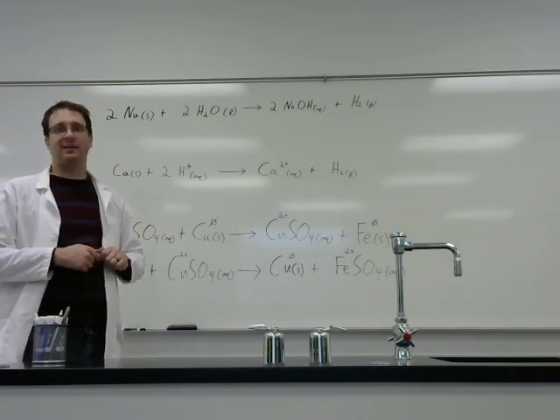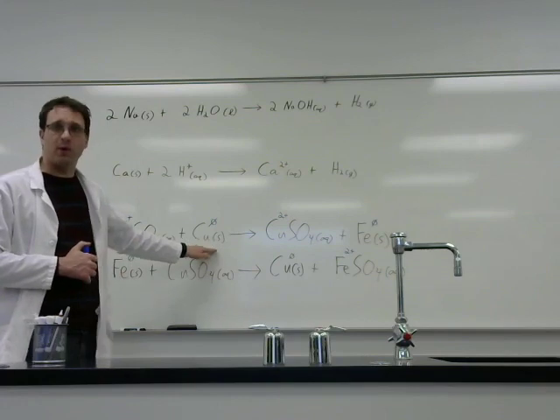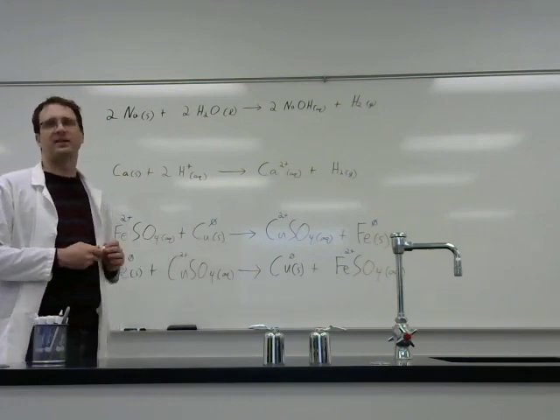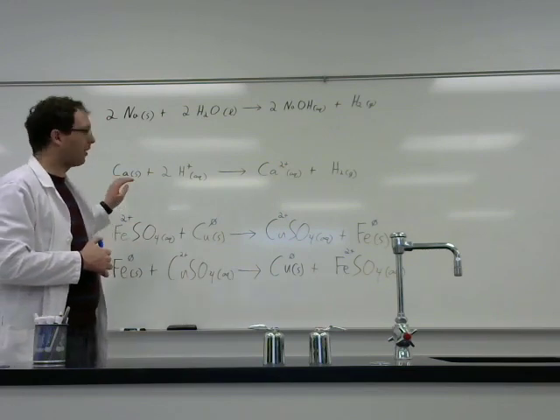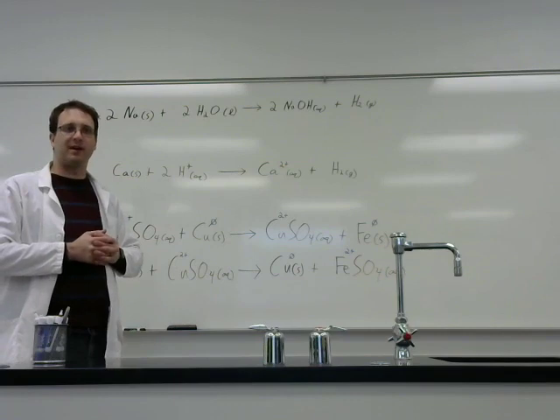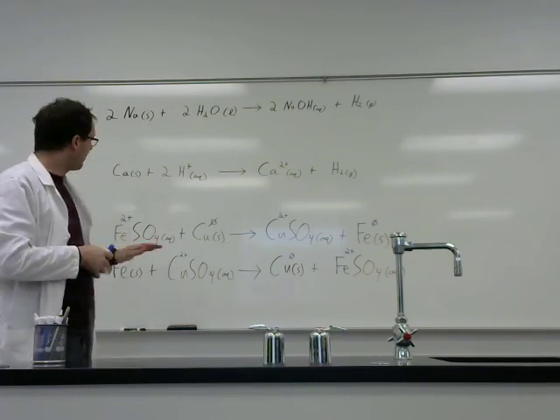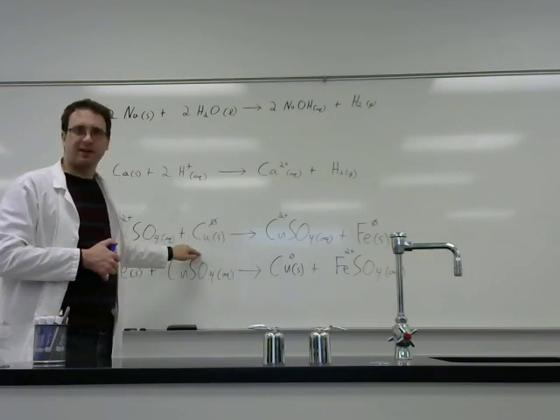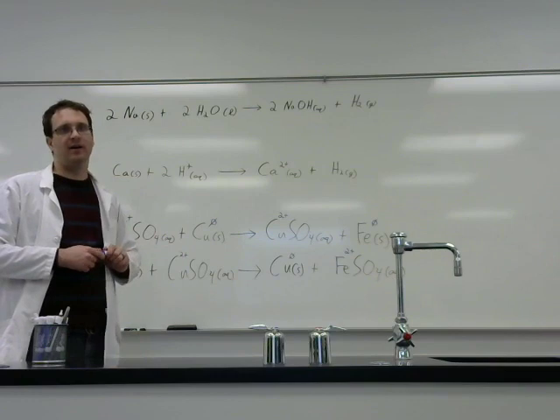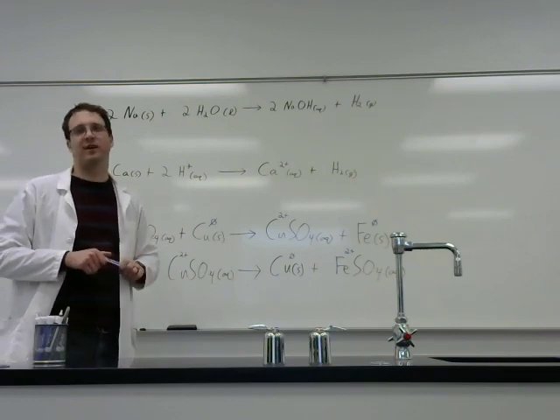That'll give us an idea of the electrochemical series, and then we'll be able to actually run these where we pit the metals against each other directly. It's like reacting them with acid is timing them in a race by themselves. And then here we're pitting them directly against each other, and so we can make that direct comparison, like seeing, instead of looking at the times, seeing who crosses the finish line first.